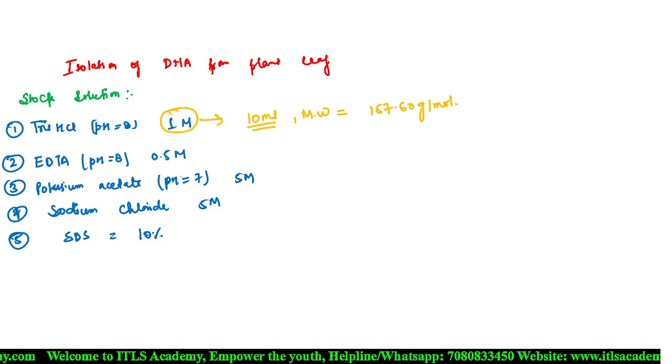Now calculate the weight of the Tris-HCl for 10 ml. Calculate this.